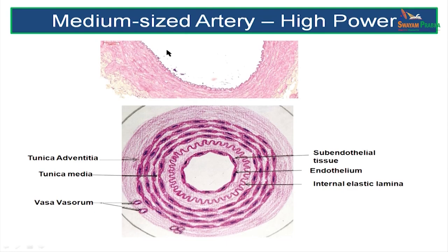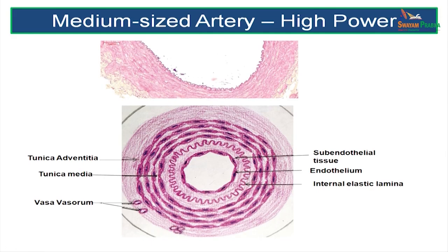In a higher-power view of the medium-sized artery, you can see a very prominent internal elastic lamina; the fine tissue inner to this is the endothelium along with the subendothelial tissue. The thick layer is the tunica media and that is the tunica adventitia. You can see a well-defined lumen with endothelium, basal lamina, subendothelial connective tissue, a very prominent internal elastic lamina, and smooth muscle cells more prominent in the media. The internal elastic lamina appears wavy because during rigor mortis, contraction of smooth muscle reduces the vessel diameter and makes the elastic fibers become wavy.